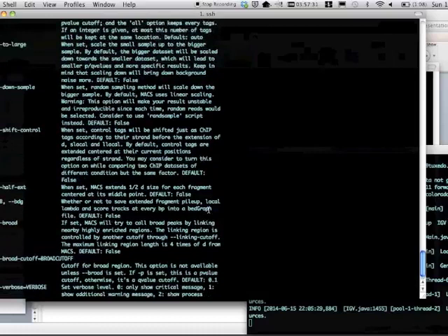And we can also specify the wall time, which is the time after which we give up waiting on the job. And we can also specify separate output and error log paths. This will instruct the job manager where to create those output log and error log files, so we can have these things in a more tidy manner.